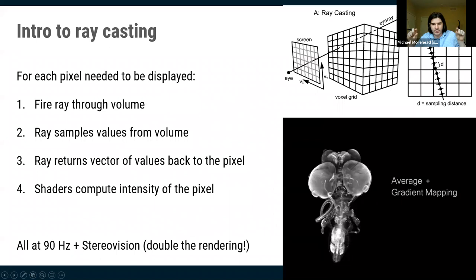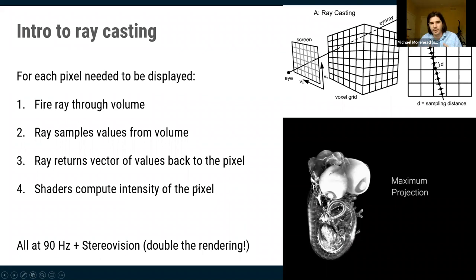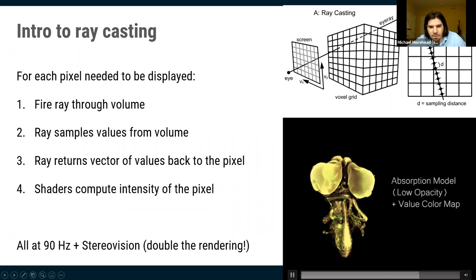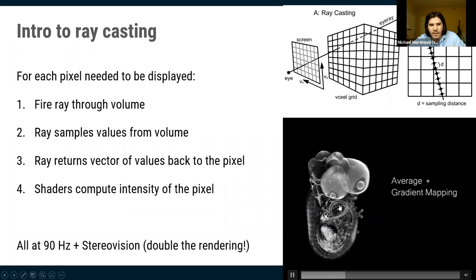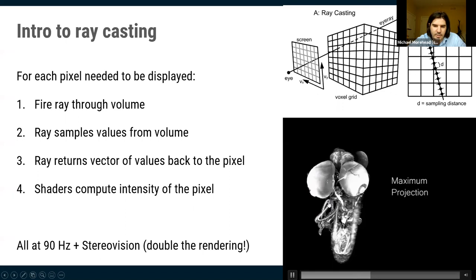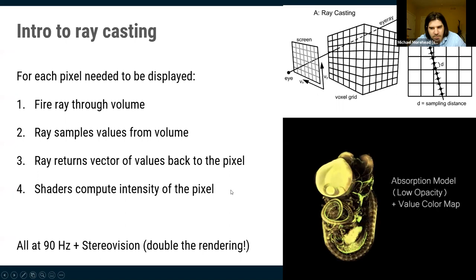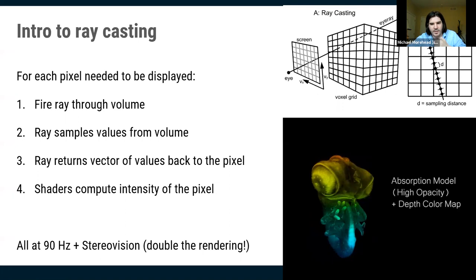You return that vector to the pixel location and decide what to project. One option: average all numbers in the vector — you get something like average intensity projection. Another popular technique is maximum intensity projection, where you display the brightest value in the vector. Both give useful results.